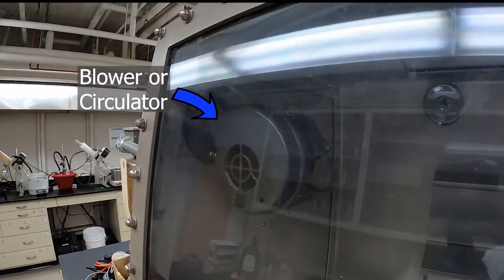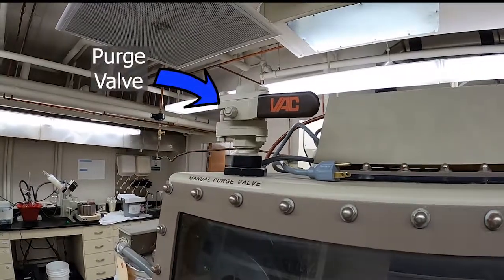There's also a blower fan, and that is the purge valve.